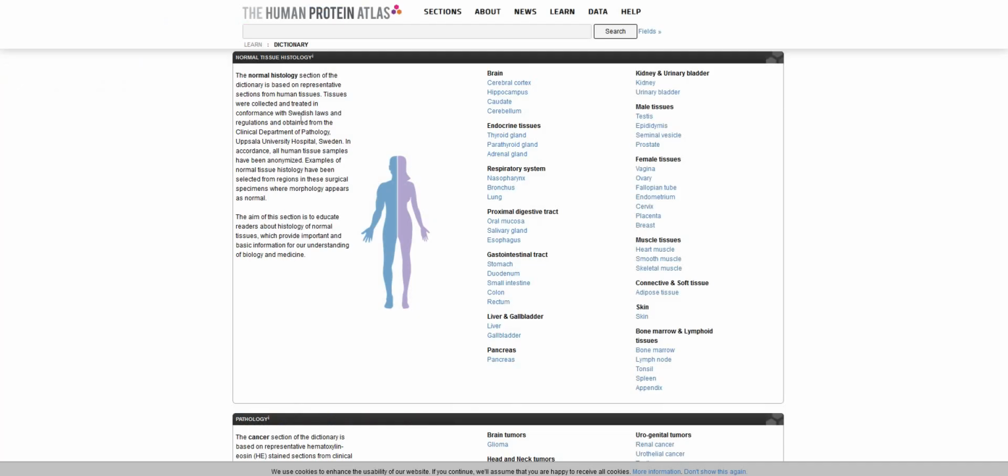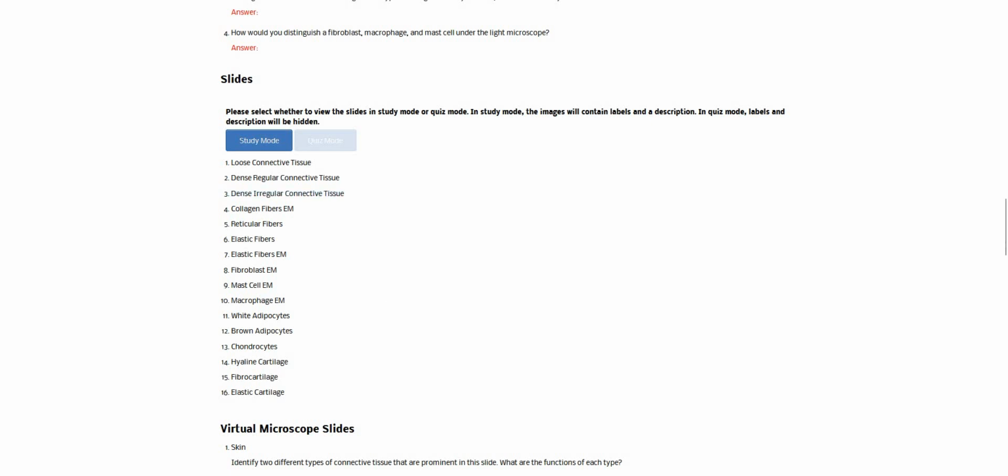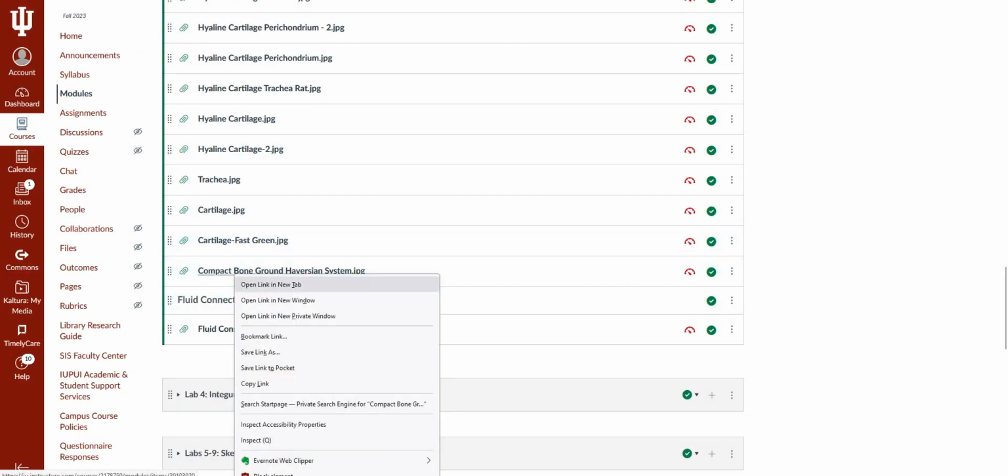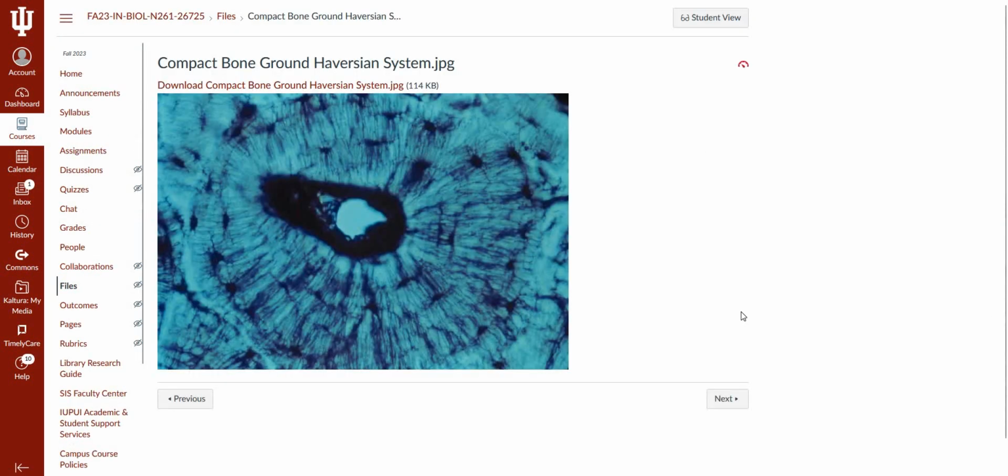Okay. Now we're going to talk about bone, just briefly. Remember, we're going to come back to it. But for today, I just want to talk about our one slide here, compact bone. So we actually have two types of bone, spongy versus compact. They are both supportive connective tissue, and they actually have a lot of collagen fibers in them. So they look pretty different and they feel pretty different than the other types of connective tissue, but they still are made of similar materials.